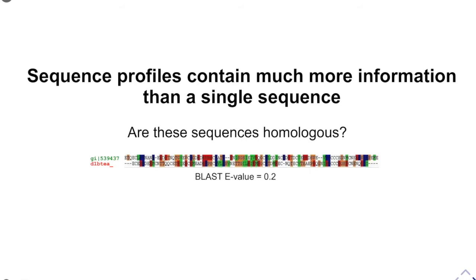Normally if people ask this kind of question, the answer is always yes, I think. But here what you have to keep in mind is that an e-value of 0.2 can be fairly random. So you have quite a high chance that you actually see by random an alignment that looks like this. So I guess if you really work with that and you want to publish something, you would not trust this alignment.